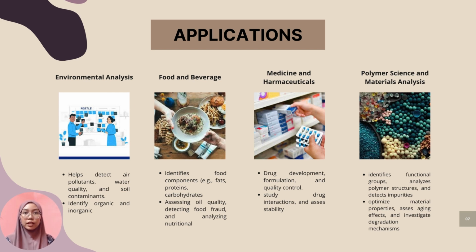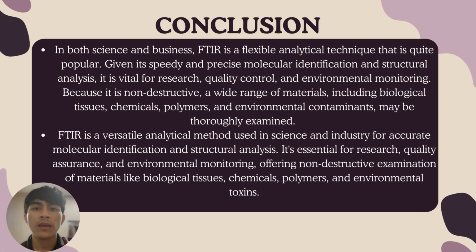For medical and pharmaceutical use, it characterizes drugs, studies biomolecules, and ensures quality control. In polymer science, FTIR identifies polymers and assesses material compatibility. In both science and business, FTIR is a flexible analytical technique that is quite popular.